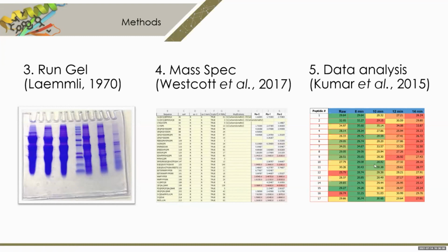At the Proteomics Resource Center of Rockefeller University, samples were digested with trypsin, desalted, and analyzed using LC tandem mass spectrometry. The spectra were extracted using MaxQuant software and queried using the Perseus proteomics platform. That platform provides statistical tools for high-dimensional omics data analysis covering normalization, pattern recognition, and time series analysis. Once the data was generated, we treated, sorted, and classified the data, developing models to help visualize trends.